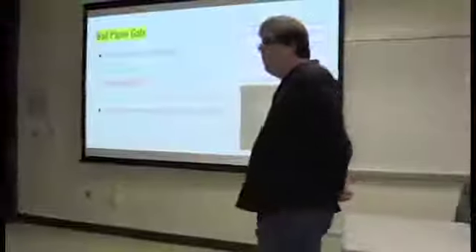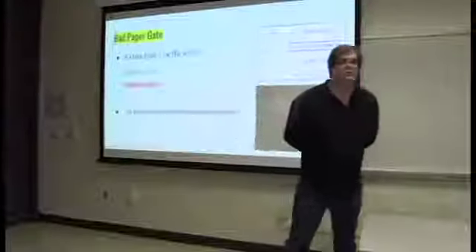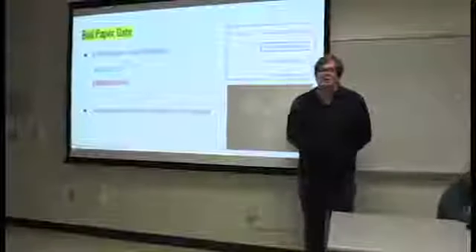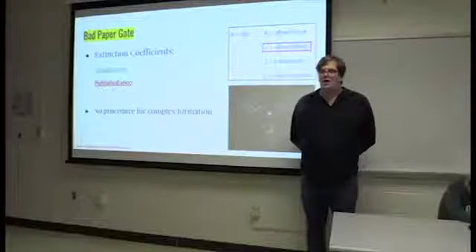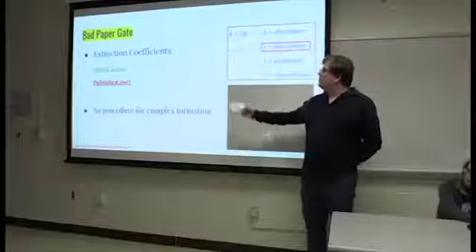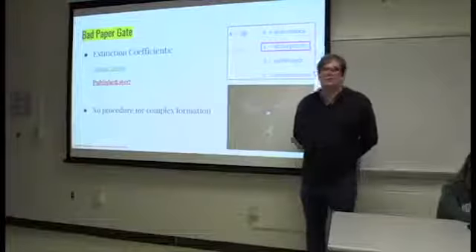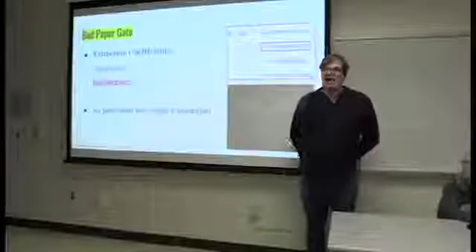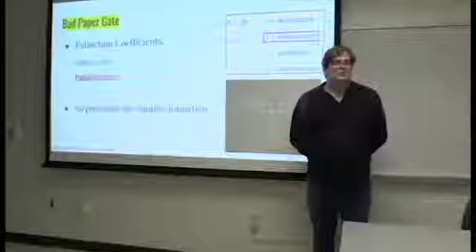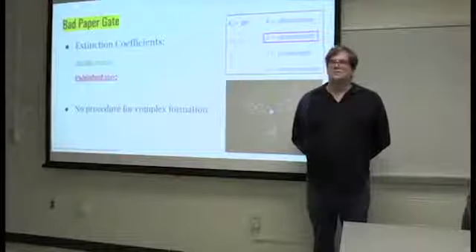Yeah, so in researching what we were going to use to start drawing some new conclusions with our data, we found that there was some bad information in certain papers, namely this example of the extinction coefficients. To give a little background on what those are, this is an equation that we can use to find the concentration of a sample, which is important to make all sorts of quantitative conclusions.